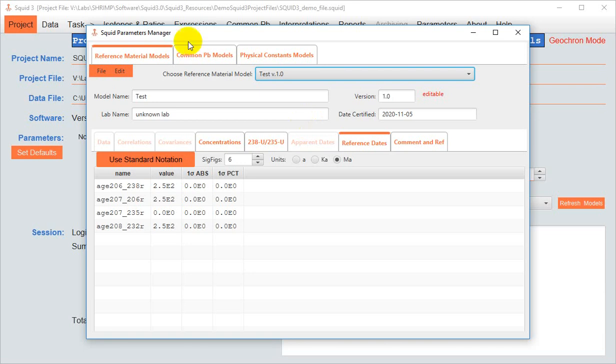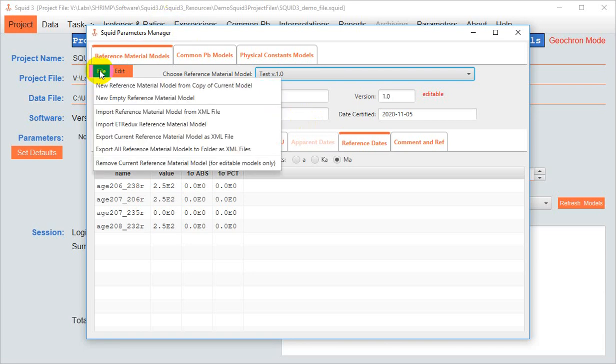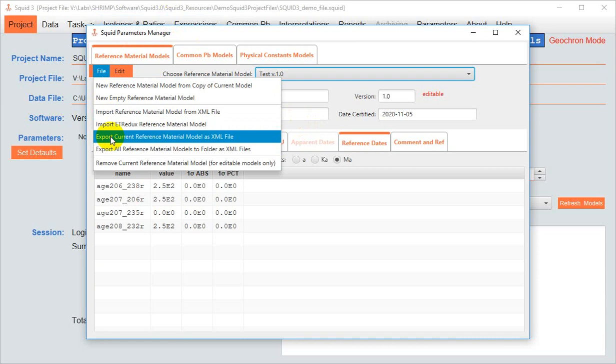Instead, what you can, and I think should do, is export the model as an XML file. That way, it is a discrete, well-labeled item that you can easily track and find, and then import into a project whenever you need it.